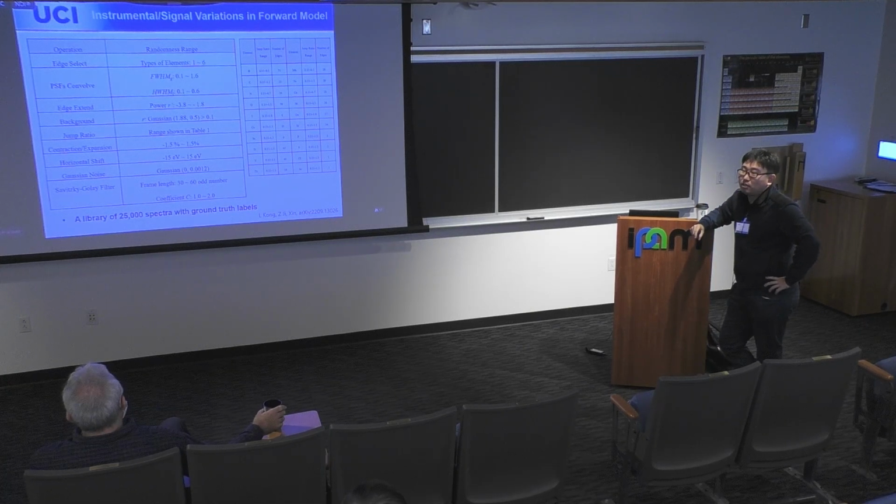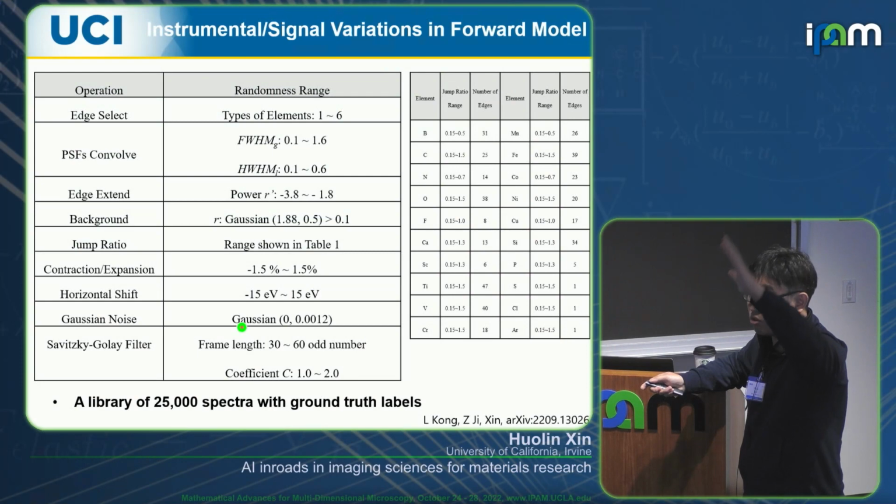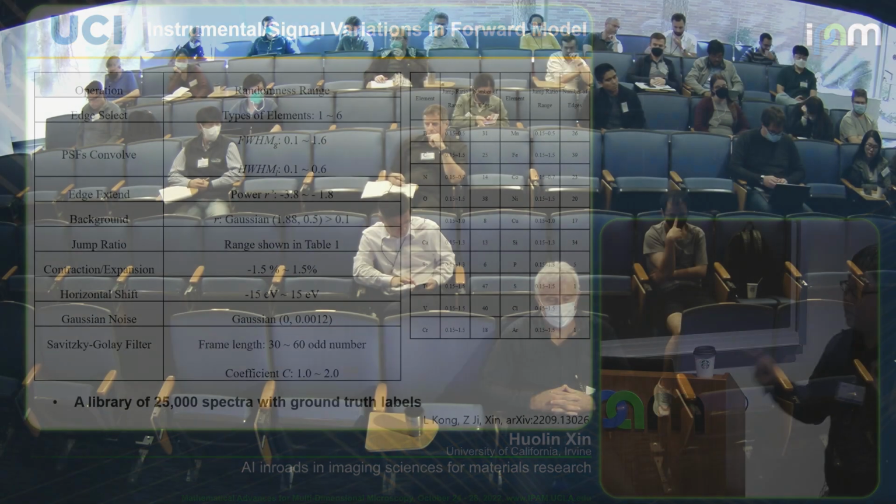The DQE for our spectrometer, if you can get to 50% with these detectors, you're really lucky. But typically you're running 30, 40%. All the later reduction in the signal-to-noise ratio is because of a Gaussian type of noise that's inherent to the later part of the detection. Well, it is, but there are very few counts at the really high end.